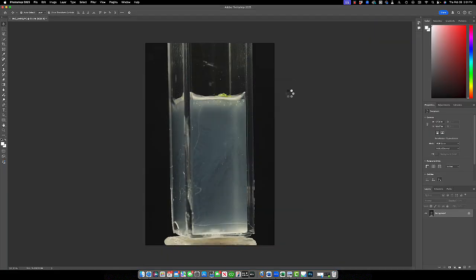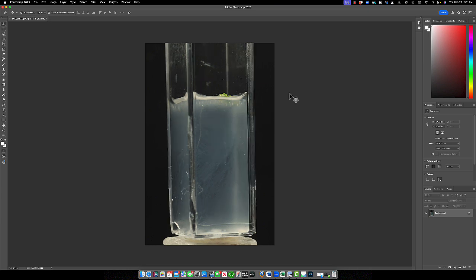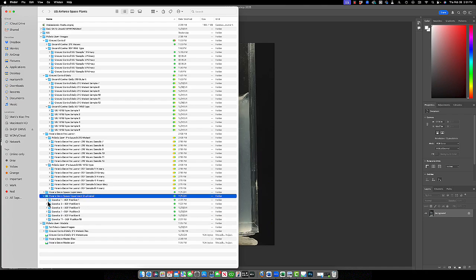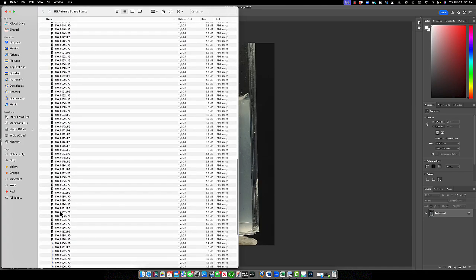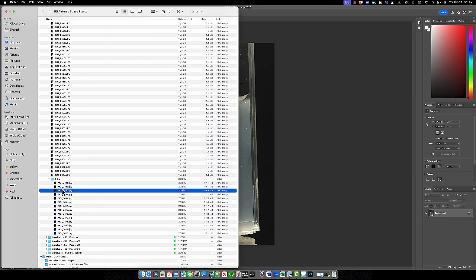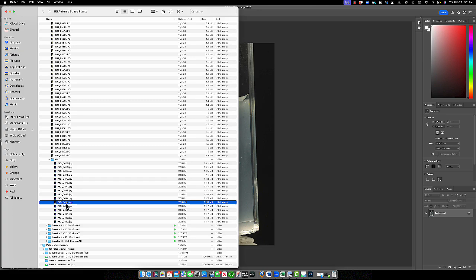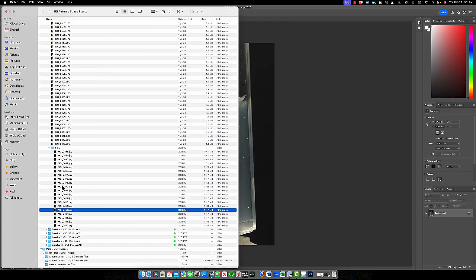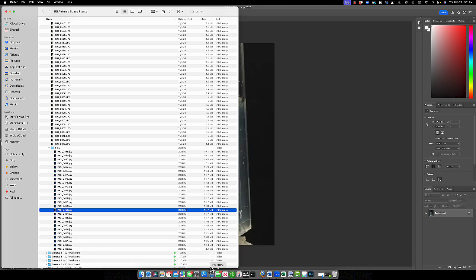So you'll see now it's going to pull each individual original image. It's going to apply those edits. And if I navigate back to the directory here, under duplicated, you're going to see a new folder being created. It's called JPEG. And now you can see those techniques being applied to all of the images contained within that folder automatically. So this is just a fast way to achieve this automated task. And we're going to do this for all of them. And we're going to import these images also into Metashape just to see if it produces a different result or works better for us. So we can almost do a side-by-side comparison.